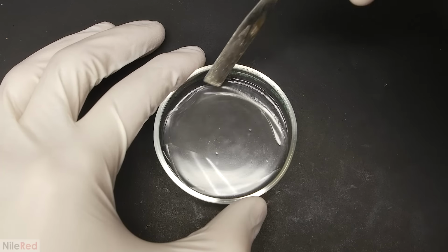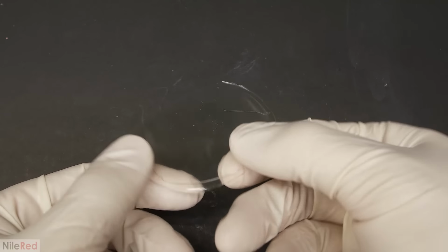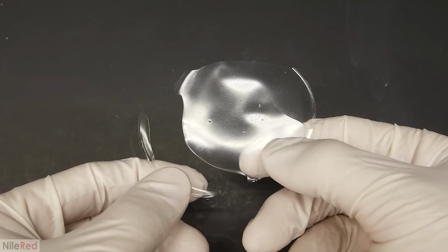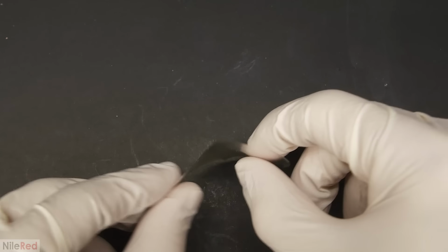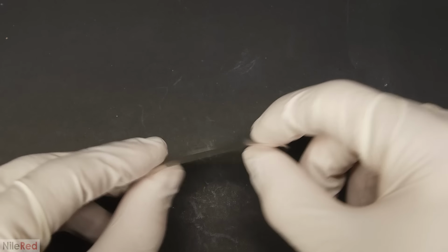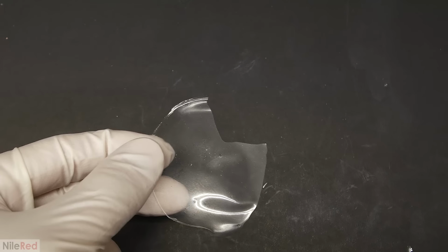I wait for all the solvent to evaporate, and I remove it from the dish. Parts of it were still pretty brittle, but in general, it was a lot more flexible. The quality of my film is definitely still not very good, but you can see that the addition of the plasticizer did get it closer to being a usable product.